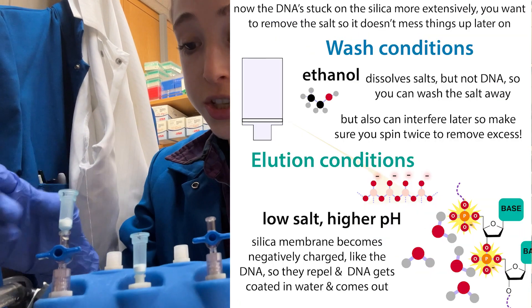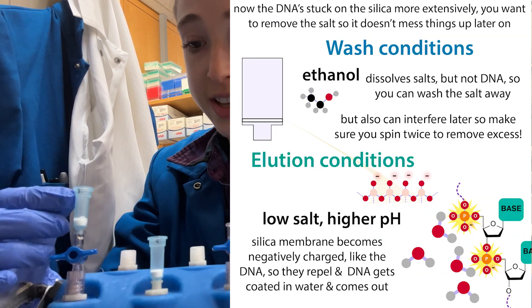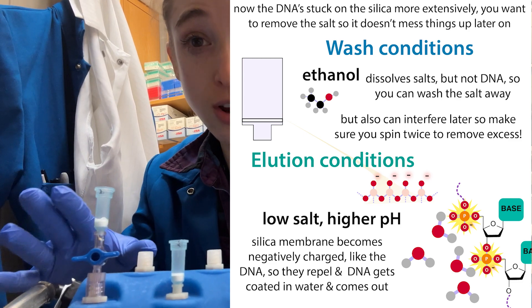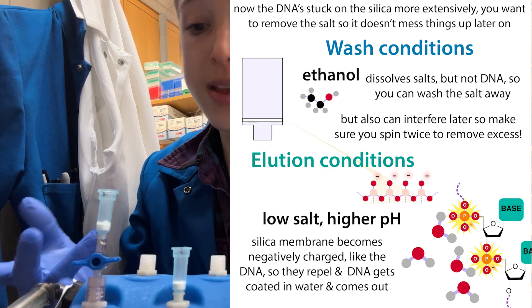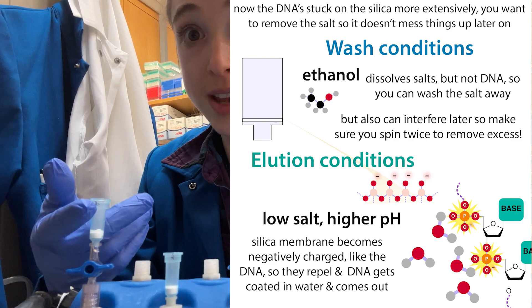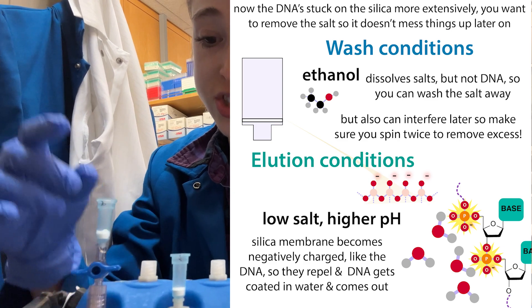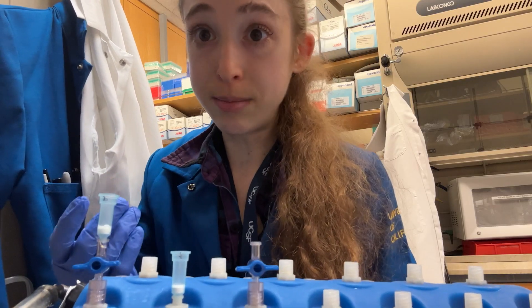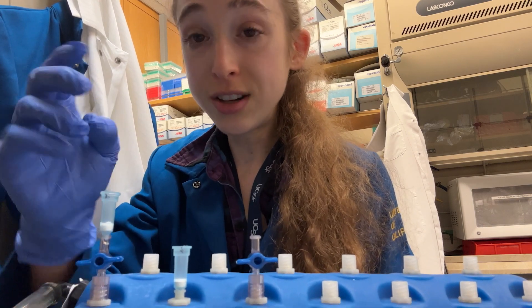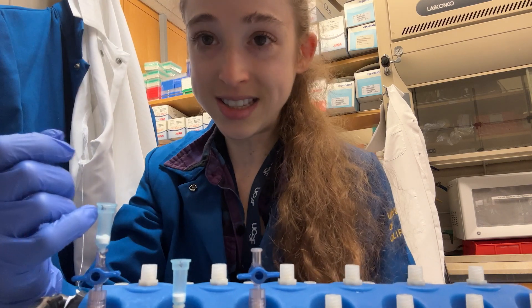When you do the washes, make sure you're not getting liquid on the outside of these tubes, especially the wash buffer which has ethanol in it. That ethanol is going to wash off your label. And even if you labeled it carefully, now it's not labeled — and the label ink can actually leach into your DNA sample, which would not be good. So make sure that when you're squirting things in, you're squirting it in and not on the side.